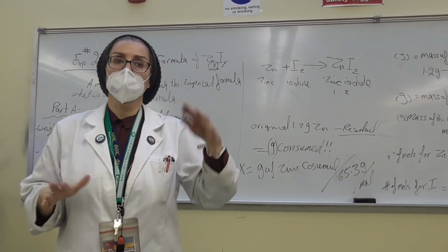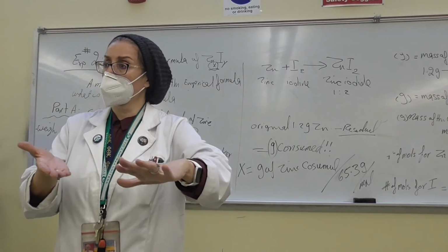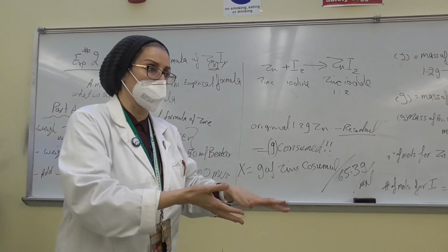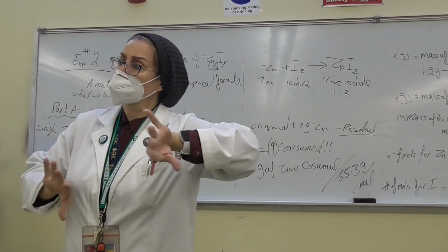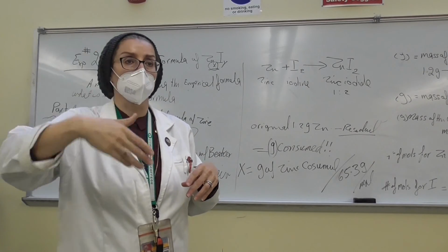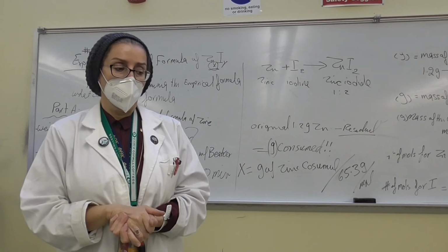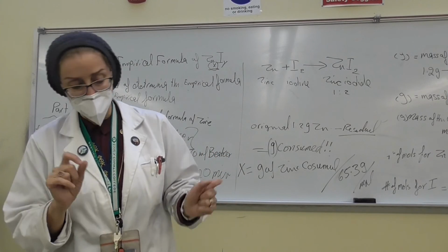And then add the chemical. You're going to have the total chemical plus the container, whether it's beaker, whether it is dish. And then you subtract the container. That's how you're going to get the number of gram or milligram of the chemicals itself, okay? So just bear with me a couple minutes.